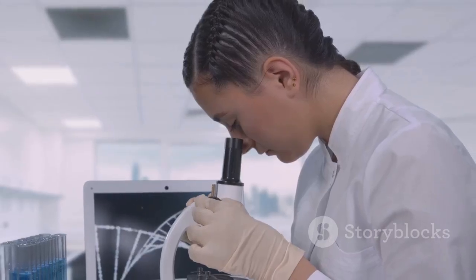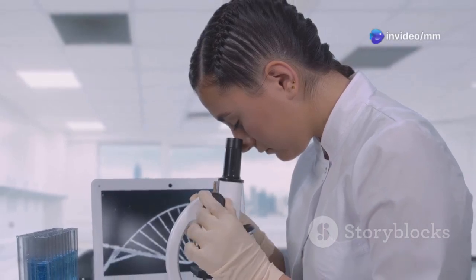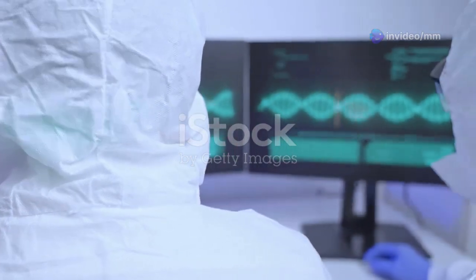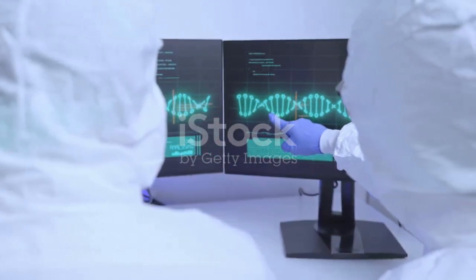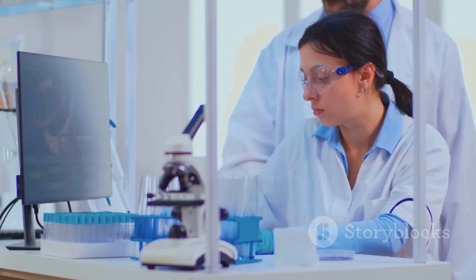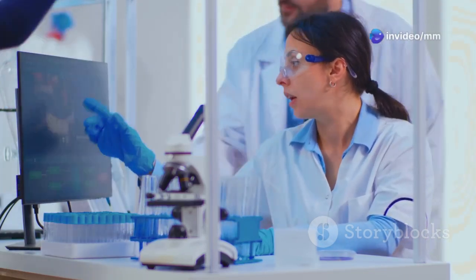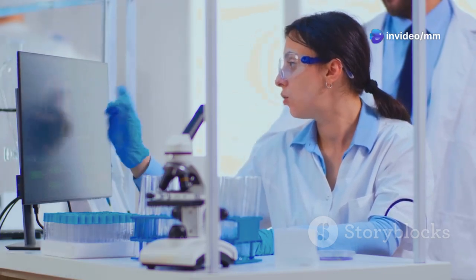The smallest fragment, representing the first base, will appear first. Let's say it's labeled with the color representing T. The next largest fragment, representing the second base, might be labeled with the color for A, and so on. By reading the colors of the peaks on the electropherogram, we can reconstruct the original sequence, TATC.